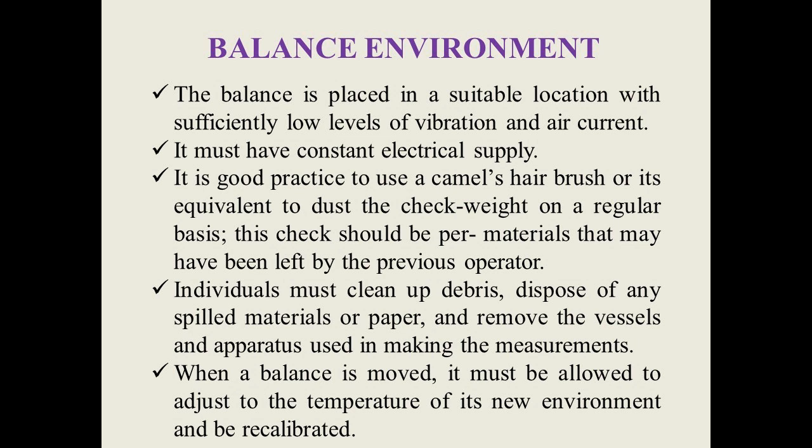Individuals must clean up debris, dispose of any spilled materials or paper, and remove the vessels and apparatus used in making the measurements. When a balance is moved, it must be allowed to adjust to the temperature of its new environment and be recalibrated.